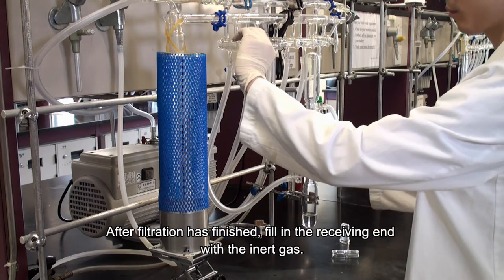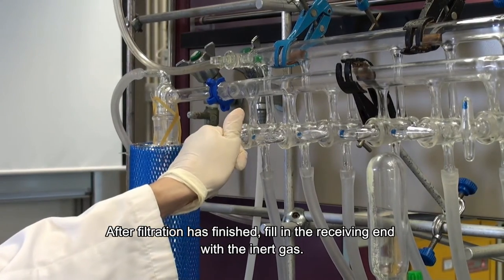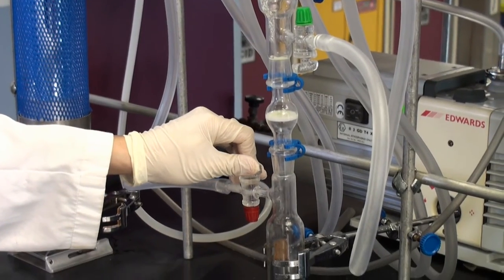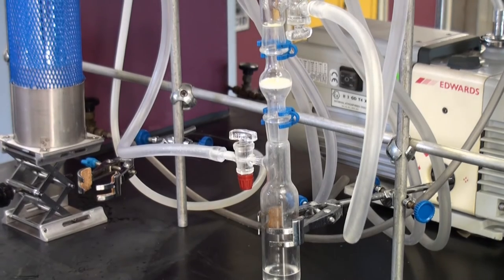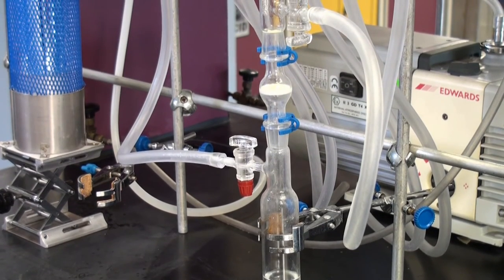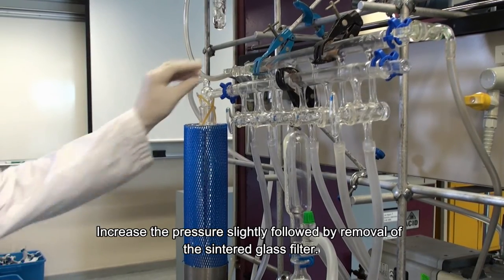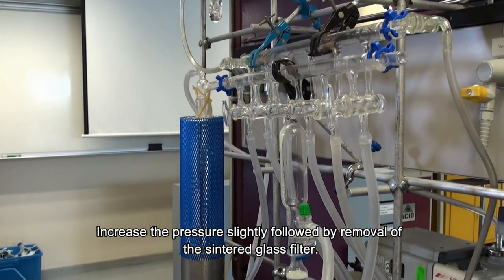After filtration has finished, fill the receiving end with inert gas. Increase the pressure slightly followed by removal of the sintered glass filter.